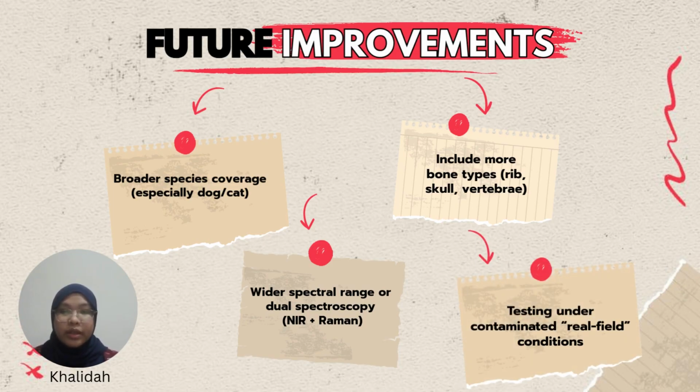This includes bones that are burned, buried, weathered, or decomposed. Environmental factors can change the spectral signals, so testing real-world samples is crucial for confirming practical reliability.